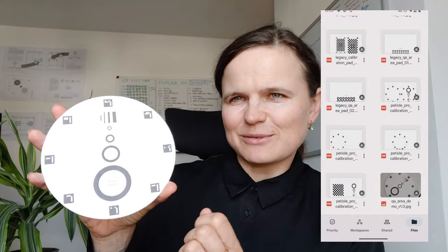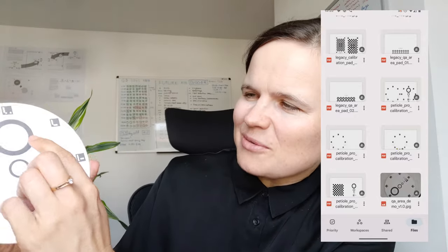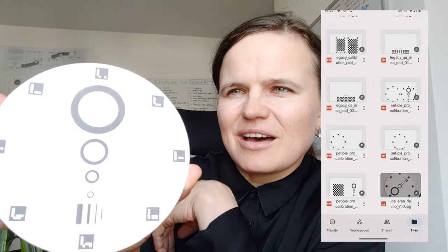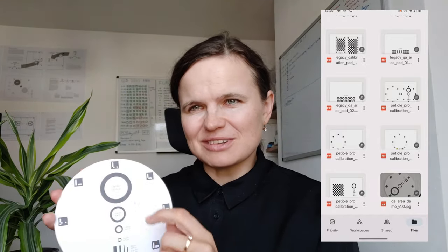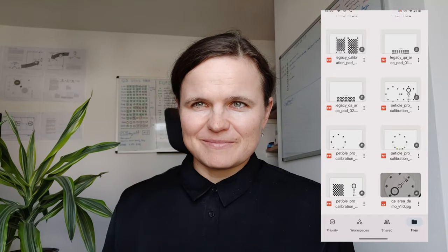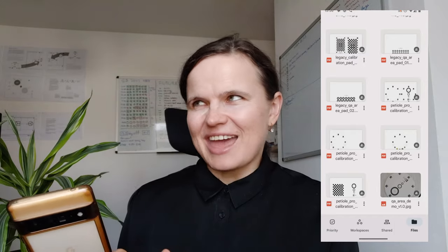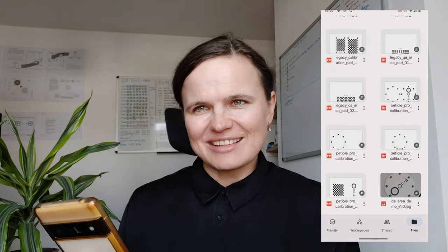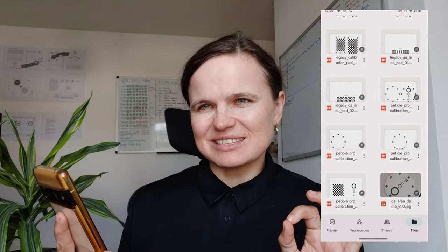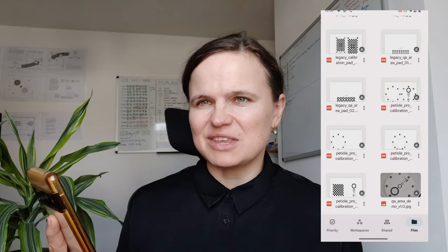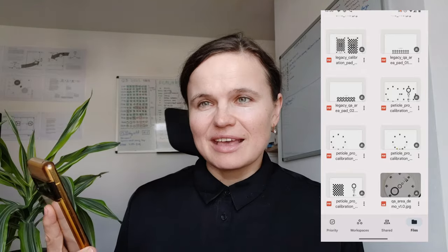This side is created specifically for checking the accuracy. If you look closer, you will see numbers indicating the area of specific circles. If you take a photo and calculate the area of the circles, you will see the accuracy of how your camera segments this specific image.